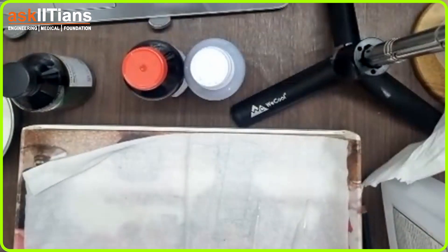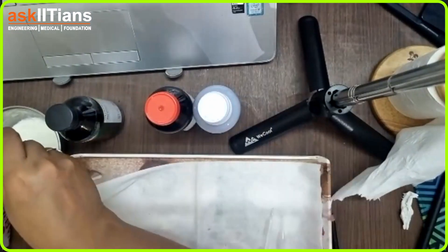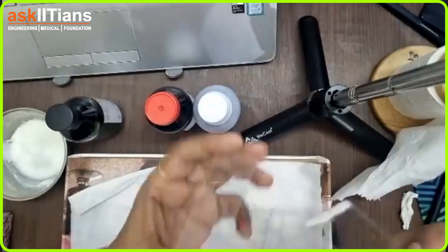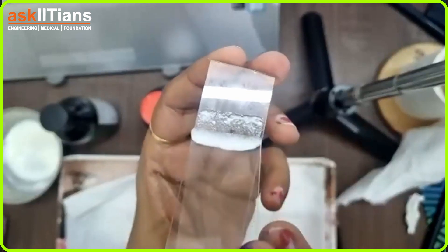Now I will be taking a little curd sample. Try to take the thicker part and not the thinner part. When you are taking the bacteria sample, you can use another slide to make a thin smear, just like this.